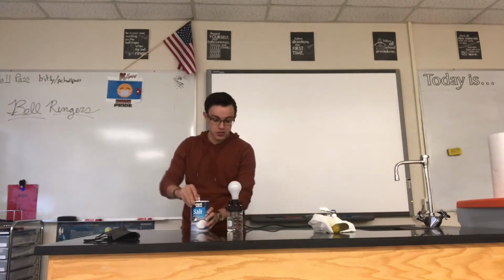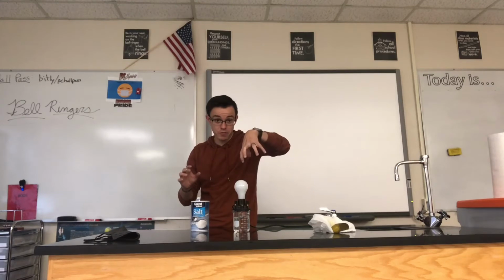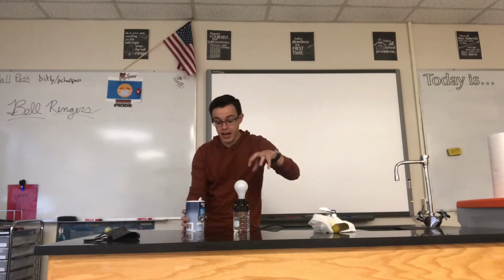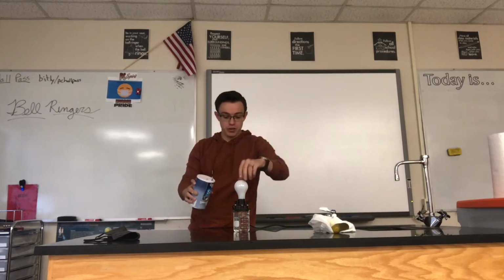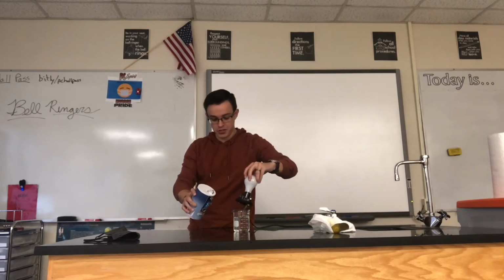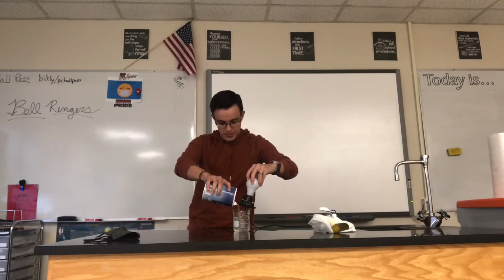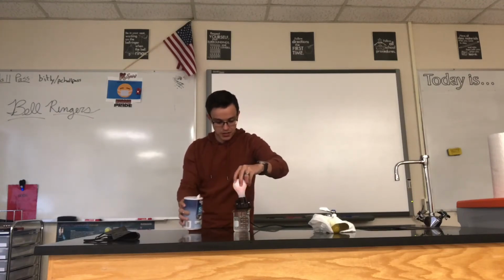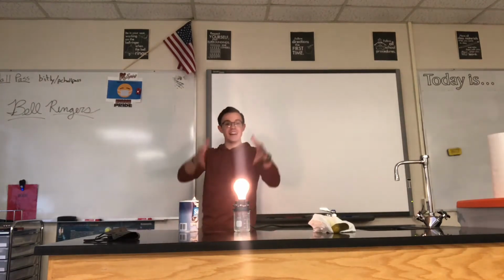Now, I'm going to try to do this smoothly. I'm going to leave the light bulb in the water. Notice it's not on. And I'm going to start pouring salt into the water, and you let me know if you notice anything. Actually, you can't let me know because you're watching the video, but just try and notice something. Okay, there's some salt. Notice anything? The light bulb is lighting up.